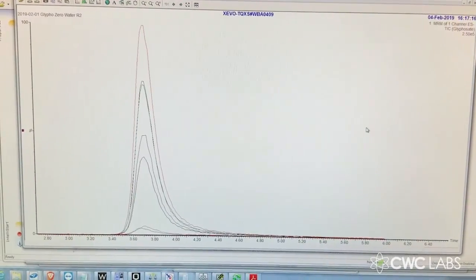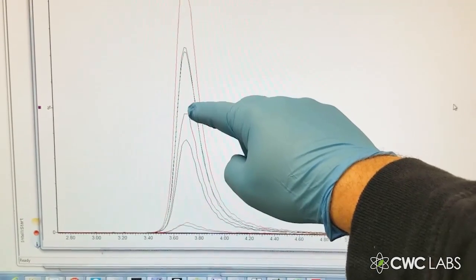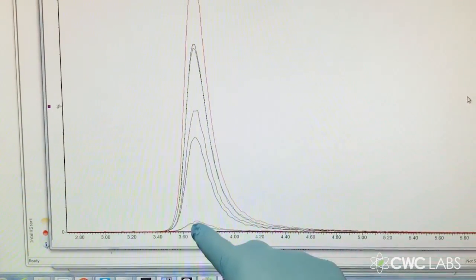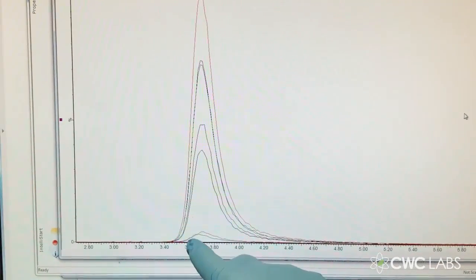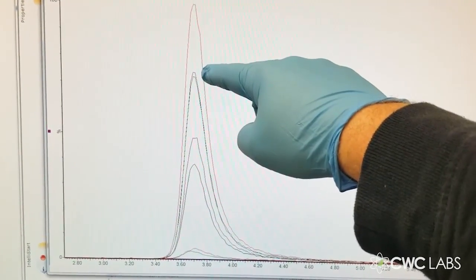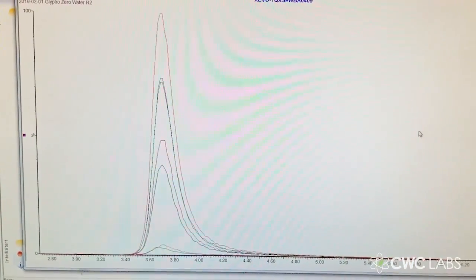Now we're moving on to the water pitchers. This red line is the original 2 ppm, and each one of these other peaks shows the resulting level of glyphosate after going through a water pitcher. This is fascinating to me because it shows down here there are 2 water pitchers that are very, very effective. There's actually one that is not even shown here, which I'll explain later. But some of the water pitchers perform poorly because they don't remove much glyphosate, as you can see from these peaks here. And these perform sort of mid-range, but these are performing extremely well.